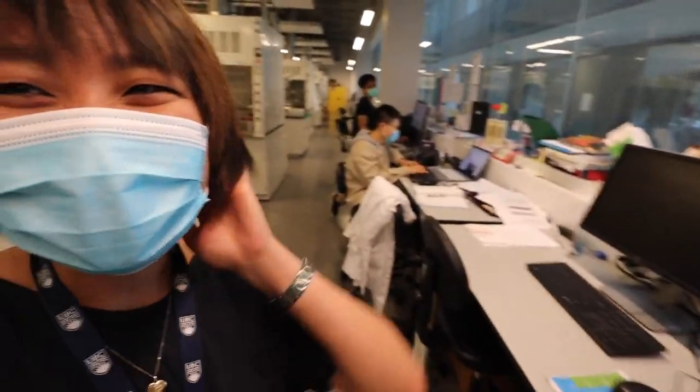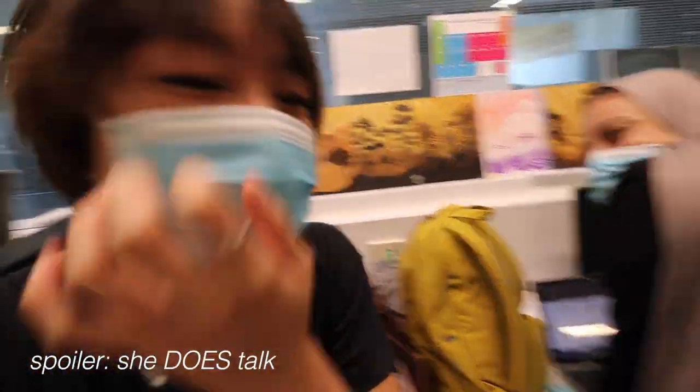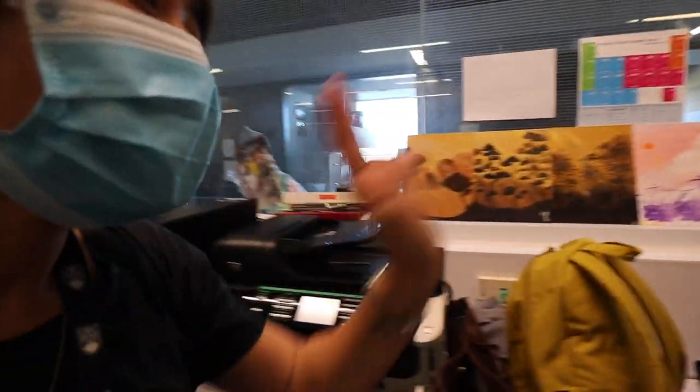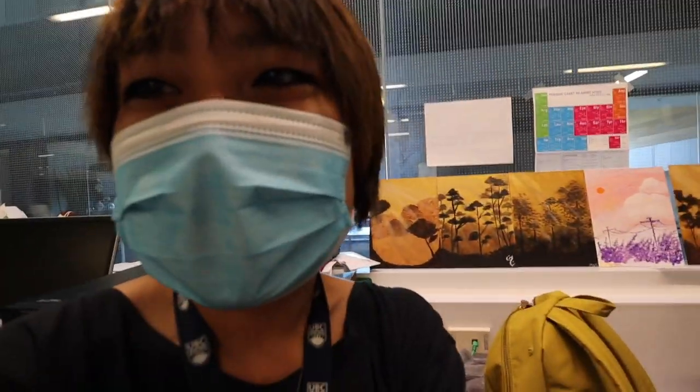Hello, happy Wednesday. I don't know why people laugh at me. It is happy Wednesday. Noju is here. She's not going to talk apparently, but she's going to show me how to make nanoparticles - lipid nanoparticles, three formulations. So I will take you with me. First step.